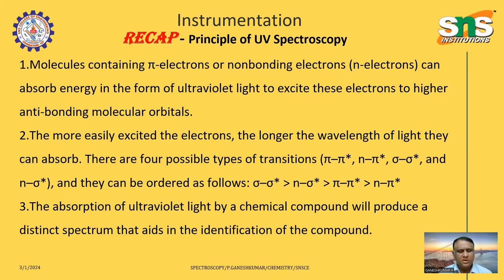The absorption of ultraviolet light by the chemical compound will produce a distinct spectrum that aids in the identification of several compound structures.